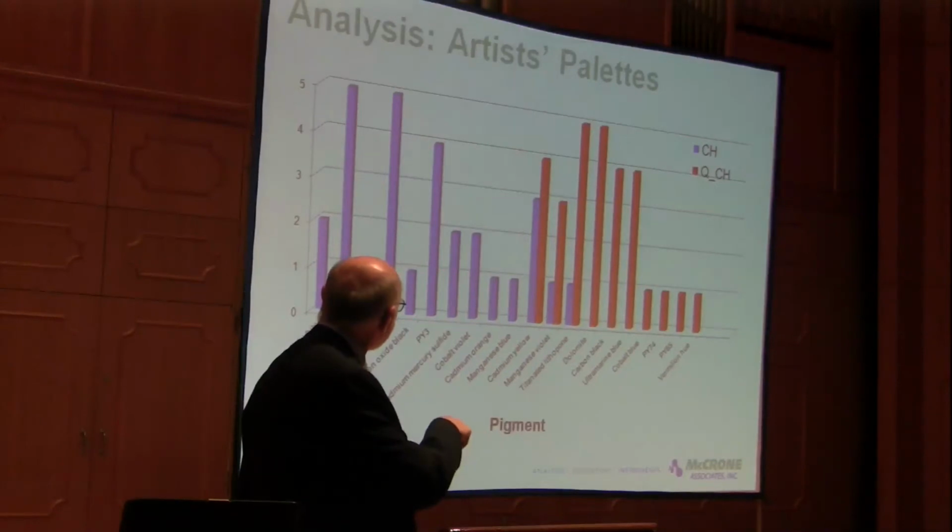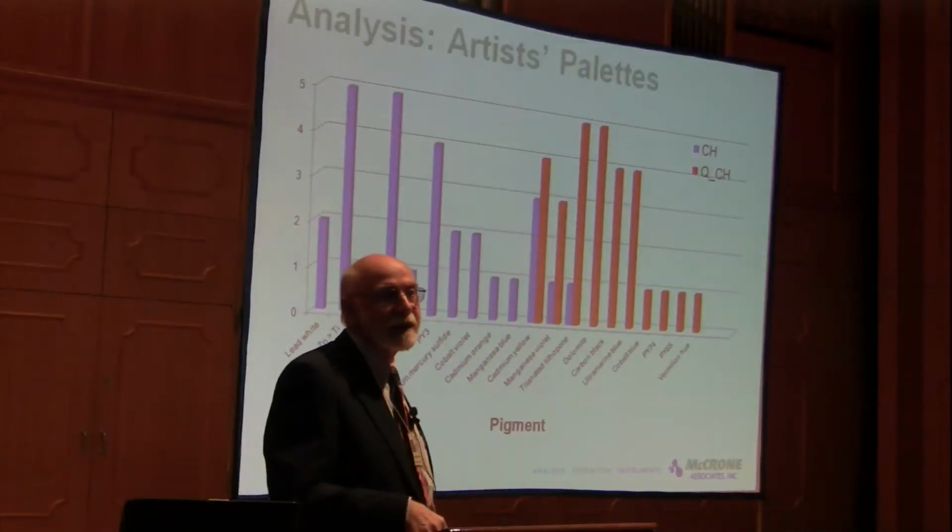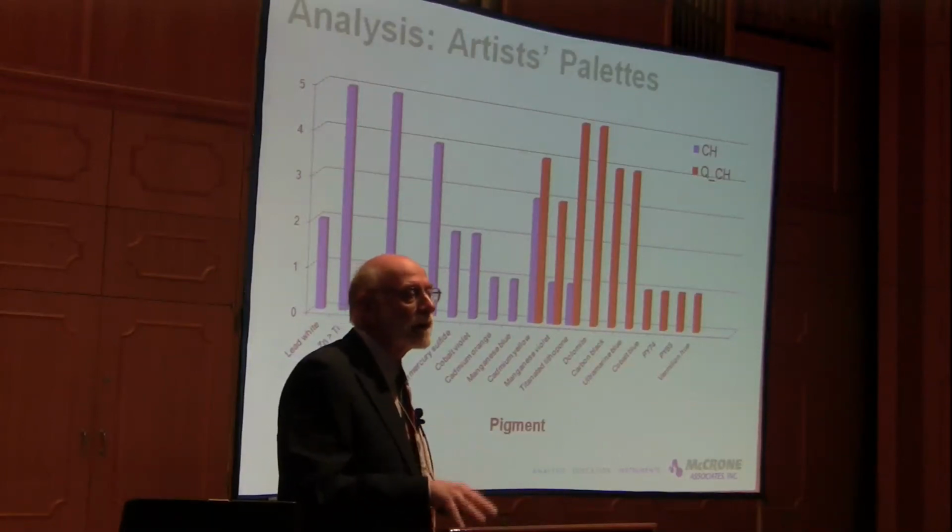the greatest differences in the whites, zinc white greater than titanium white, and in the case of the questioned, it was primarily titanated lithophone, which is this guy here. We found one of those in the Clementine Hunters, but not too many. One of the fascinating things from a materials usage too is we see here ultramarine blue in just about all of the question pieces and none in Clementine Hunters.